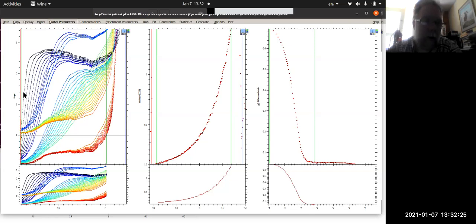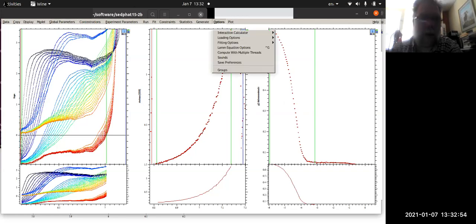You can imagine, though, that there's still an inflection point in each of these curves. It marches down radially as a function of time as you go from dark blue to red. And because we're trying to fit 3 different data sets into one computer screen, the sedimentation velocity experiment is now squished. In the middle panel, we have sedimentation equilibrium, just a single curve. And on the right-hand side, we have dynamic light scattering. All 3 of these are describing a protein based on size, or maybe a protein mixture based on size.